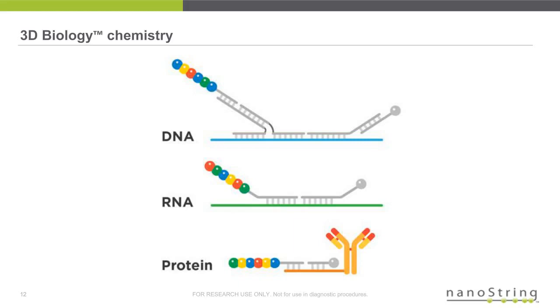If there's a mismatch in that region that I highlight, then that complex is unstable and you don't get a count. So we design a probe to the reference wild type allele. We design a probe for the specific mutation that you're looking at analyzing, and then we compare the counts between those. With that technology, we're able to identify single nucleotide variants or small indels.